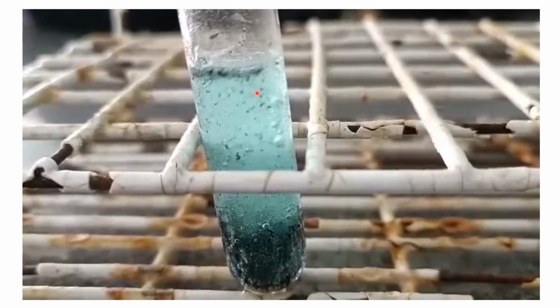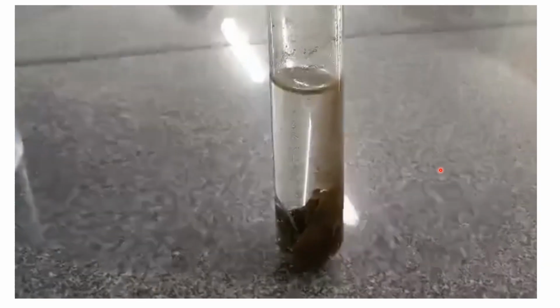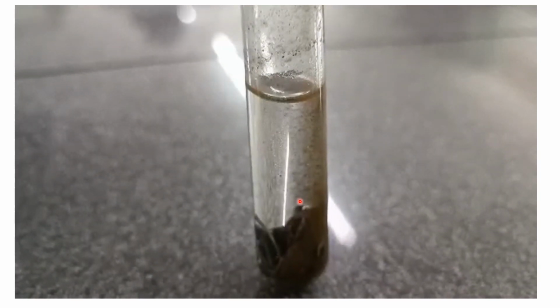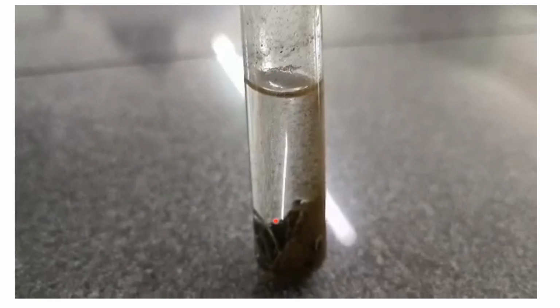Okay. So initially, you see that the solution is blue. Now, after standing for 2 days, this is what happened to it. There is still a reaction, you will see. There is still a reaction. But what is observable is the disappearance of the blue color. It became colorless. So this portion is decanted into an evaporating dish.